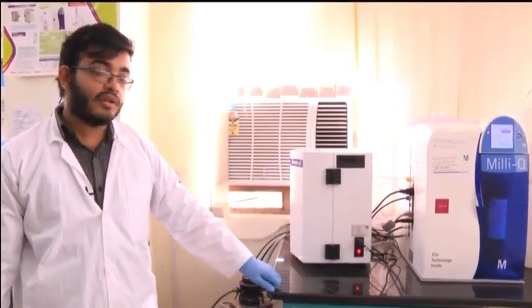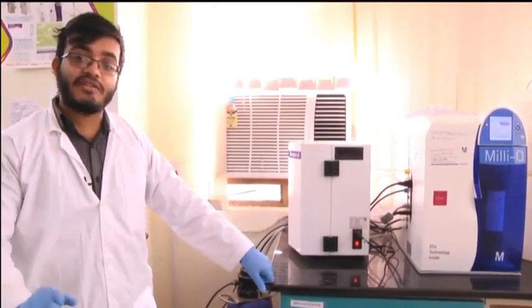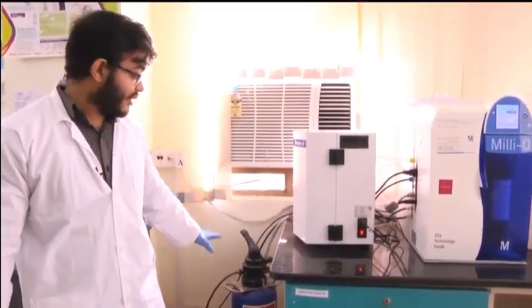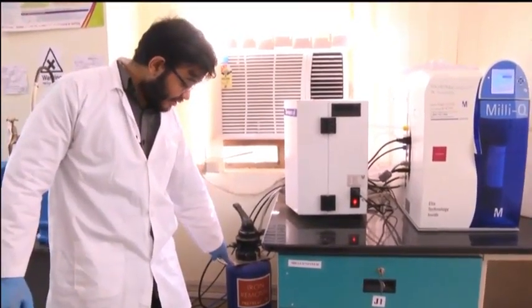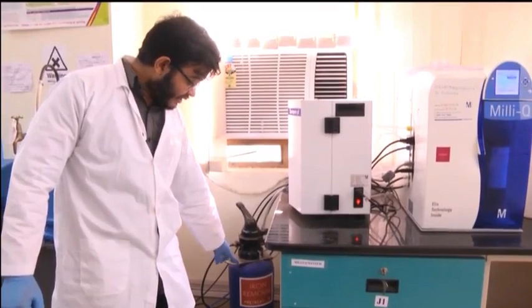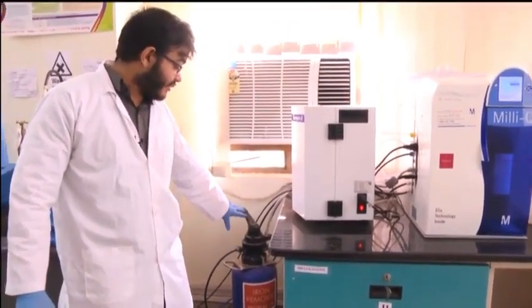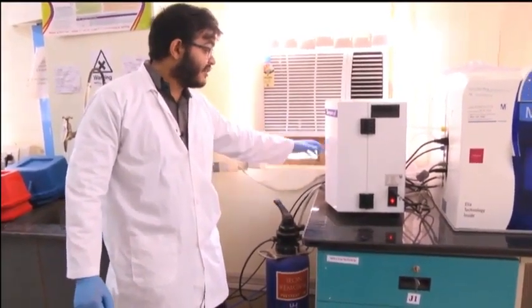purified deionized water. I will not talk too much about the internal components, but basically the tap water source that is coming to the laboratory initially goes through, as you can see here, the iron removal cylinder. What it does is it removes the iron and other heavy metal impurities.